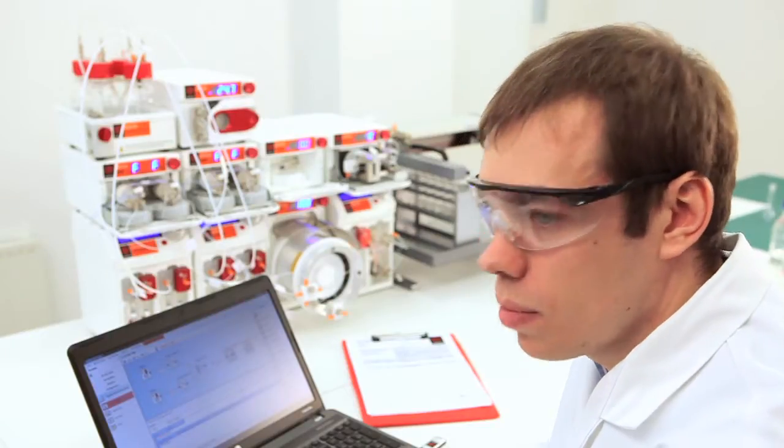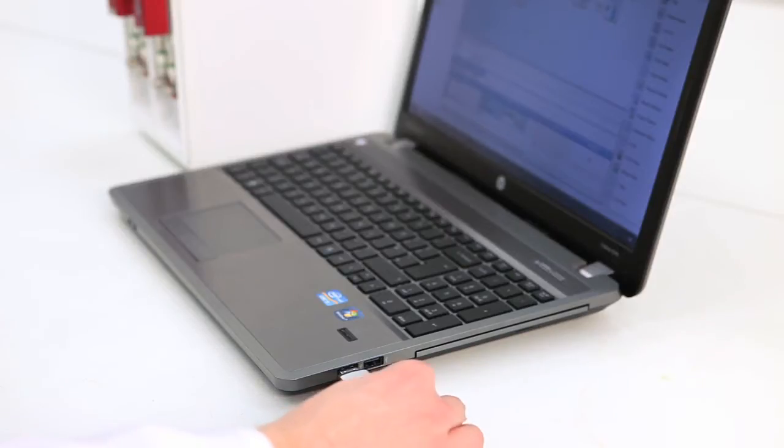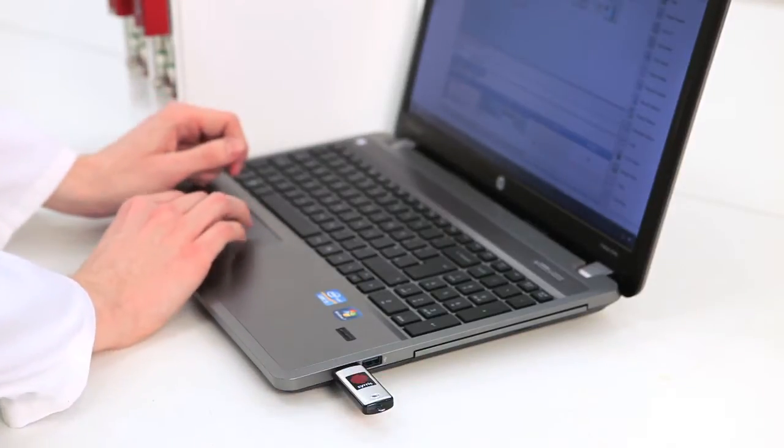Using an automated Asia system, chemists can set up a list of hundreds of experiments in a matter of minutes or import a list as a CSV file from DOE software, then run those experiments automatically.